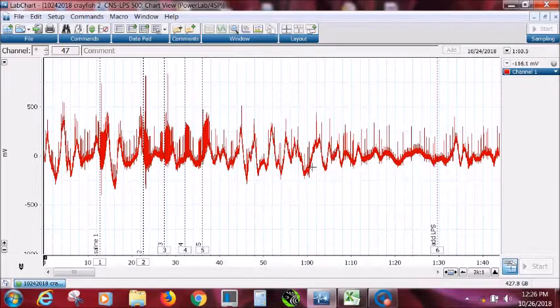This wiggling up and down can't really be avoided in these animals too easily, because the whole abdomen is in the dish and the little swimmerets are still moving around, or the animal can move its abdomen a little bit even though it's cut away from the thorax. So there are movements in the animal, like those swimmerets moving, that cause the saline to move around, and that causes these deflections in the recording.